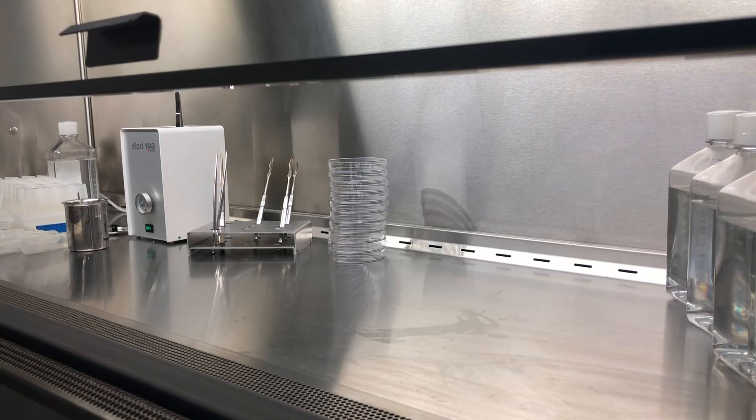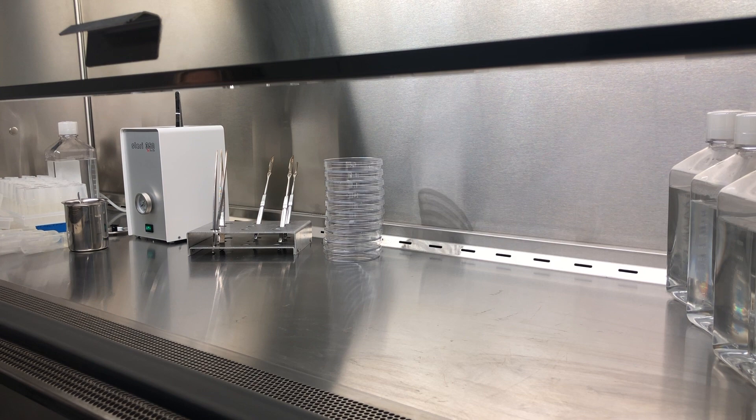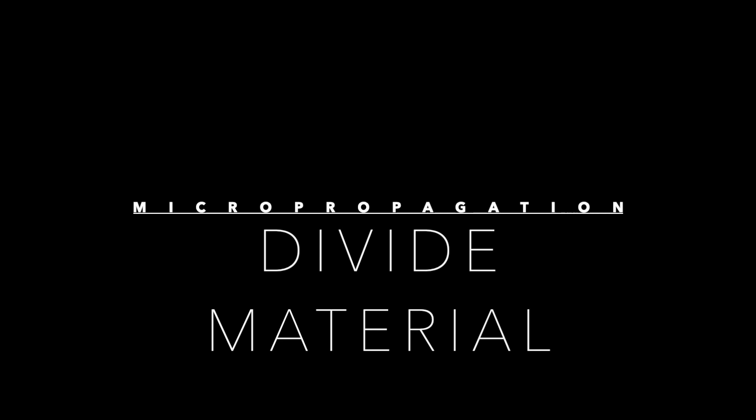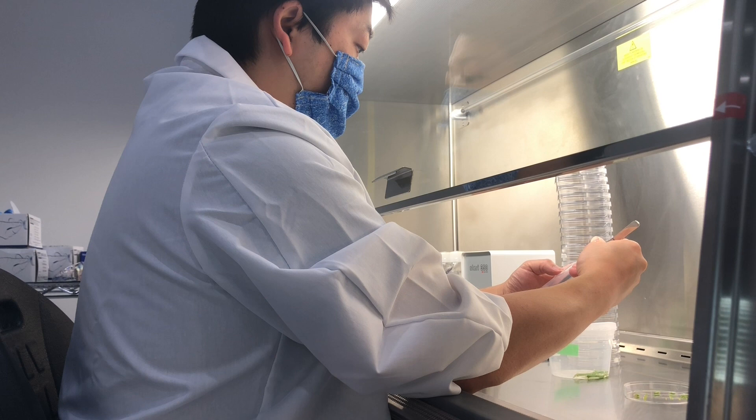To prevent contamination and fungus growth, everything needs to be as clean as possible. I make sure to sanitize my work surface first, but my plant material needs to be clean too. I rinse it all with soapy water, bleach, and sterile distilled water.